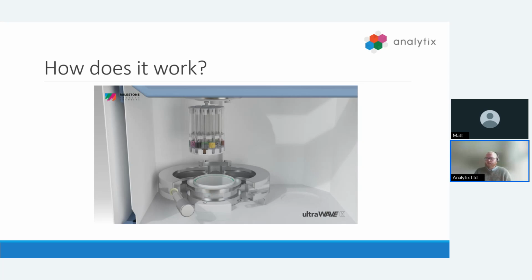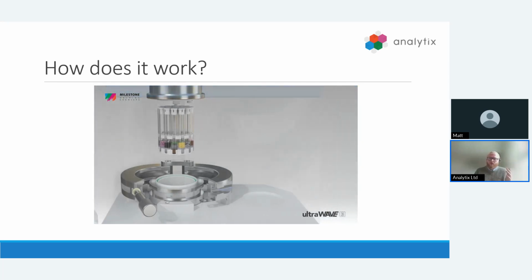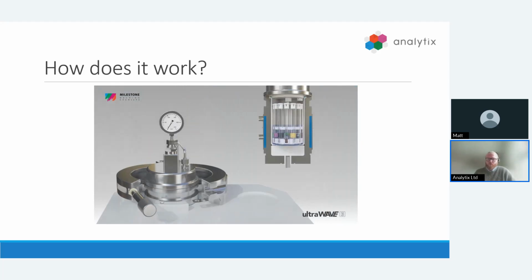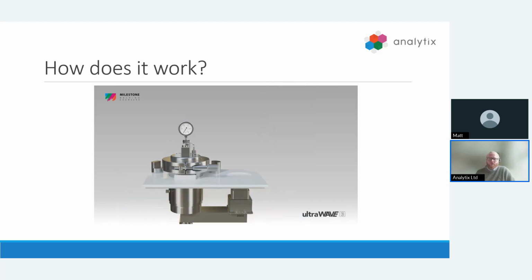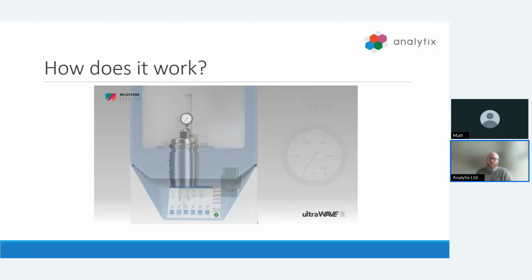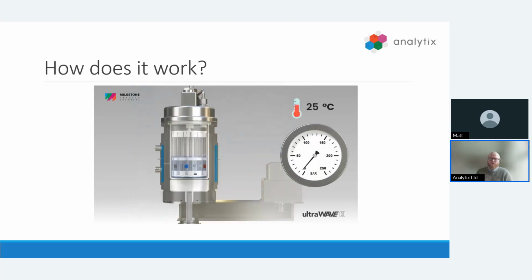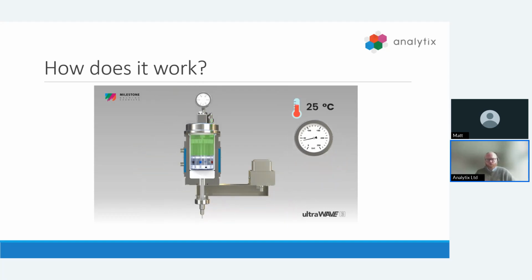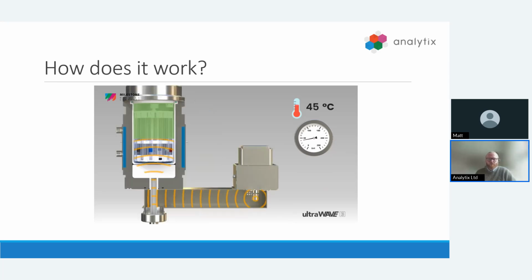These are then taken to your analytical system where you are loaded into a PTFE lined stainless steel reactor with a base load. This is then sealed. Once sealed, this is then pressurized with nitrogen. This pressurization with nitrogen prevents boiling of reagents when heated, loss of elements, and prevents sample cross-contamination, all while sealing the caps onto the vials. Once pressurization is complete, the microwave heating program can begin to reach that target temperature that we've set.